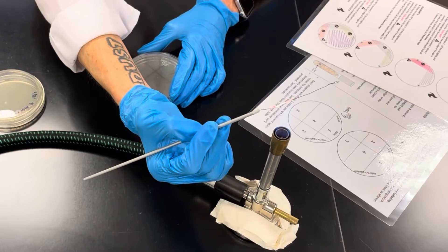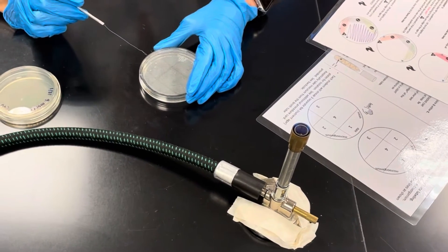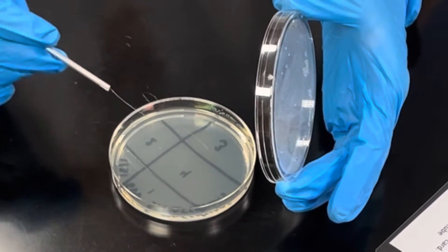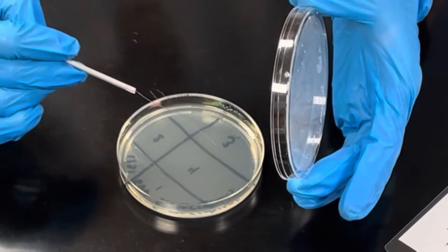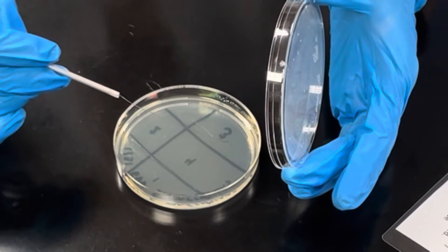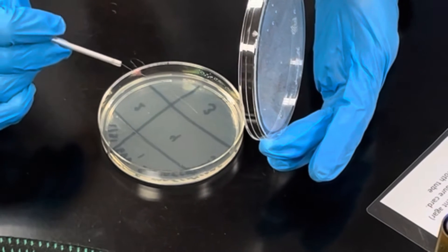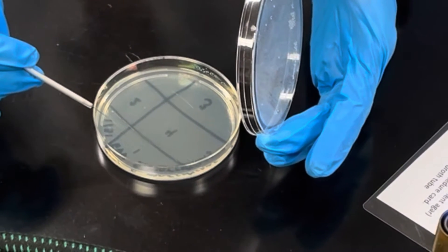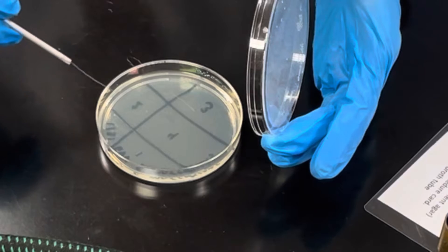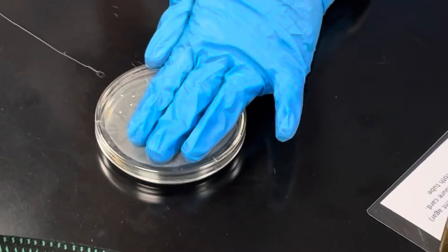Flame from the base to the tip until it glows orange. Now rotate to quadrant four — the money quadrant — where we often get isolation. We do things a little differently here: pull bacteria from quadrant three into quadrant four, but only go into it twice. Make your tight Z — one, two — then streak out using all the remaining real estate of the plate without crossing into quadrant one or back into quadrant three.